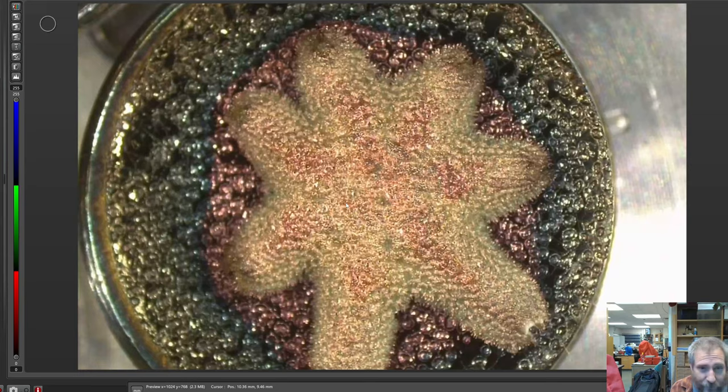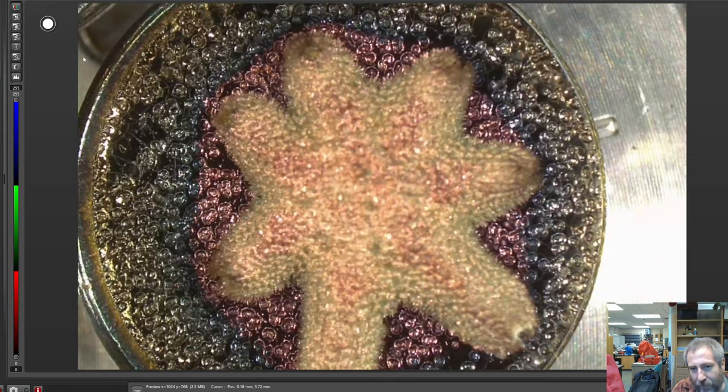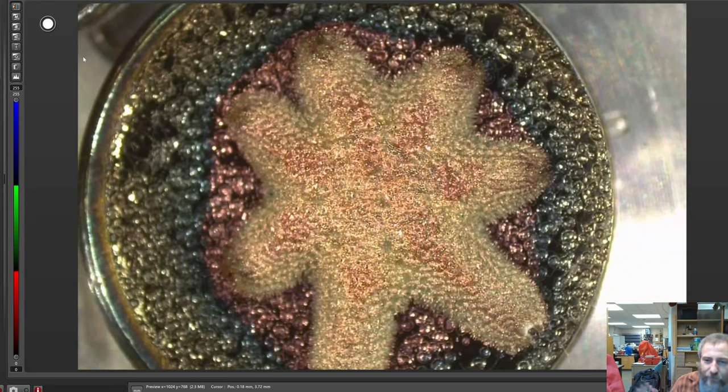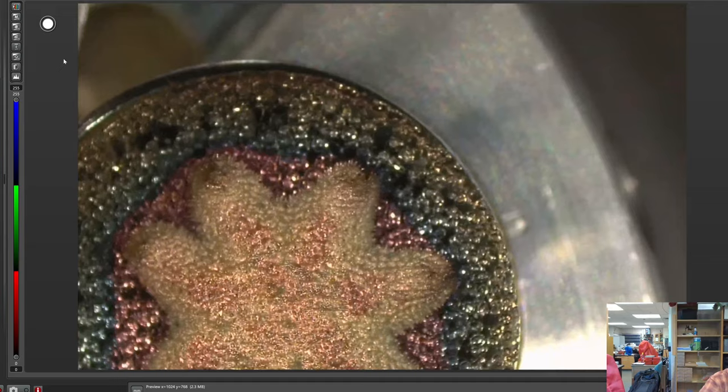This stereo microscope actually has a really cool feature, which is focus stacking. It would allow us to take a picture where we focus through from the very bottom, which is where the carbon tape is down here. I could focus through the entire subject up to the top of it like that, and it would stack all of the parts that were in focus together and produce an image that's all in focus at once. But until we actually took a picture like that, it would be kind of challenging for us to see. So let's go look at just one of the edges, around the edge of one of the arms.